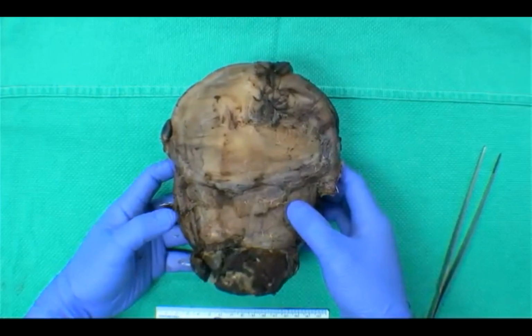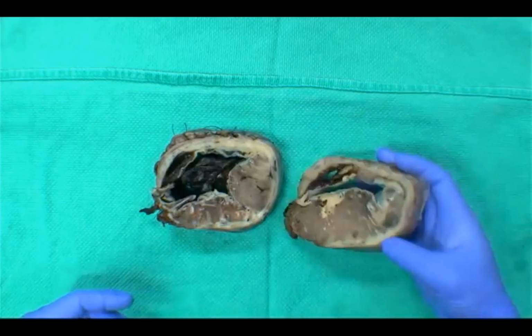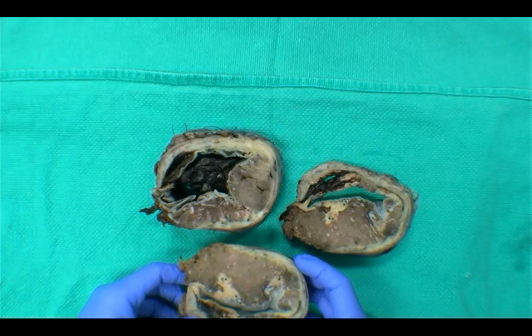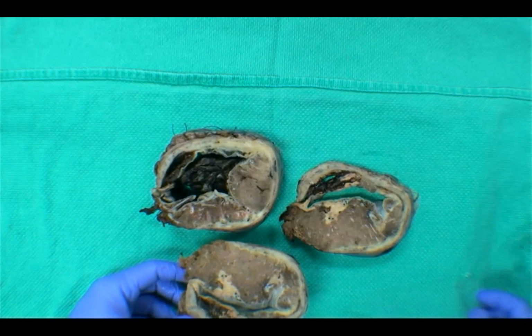So, for example, this is another hysterectomy specimen that we have, which we have previously cut. It goes this way. So this is an example of what you should see after you've taken your transverse sections.